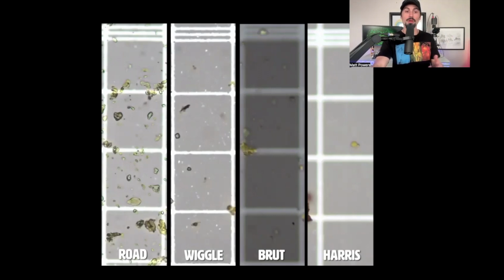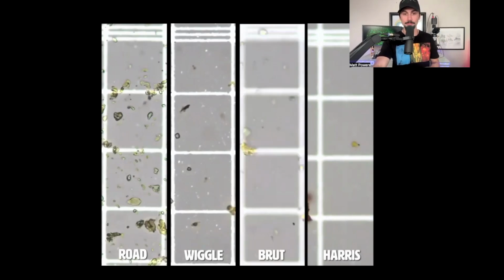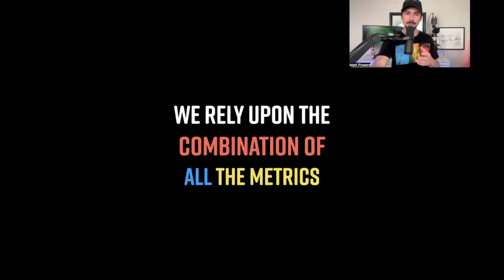In trying to make a more accurate live-dead test stain for soil microscopy, which is what this originally is, and is still part of that procedure, you're able to do both by stacking these. I want you to know these things are possible. I want you to know we built workarounds. So what if we rely upon a combination of all these metrics?